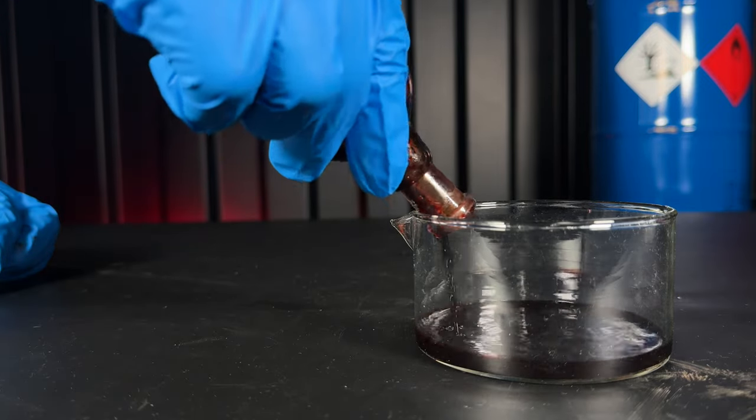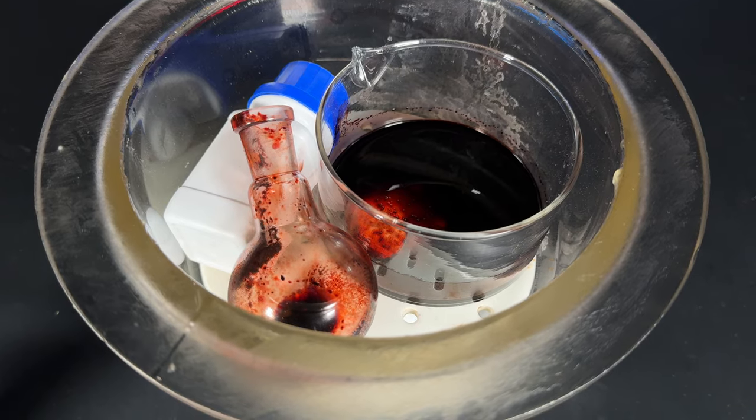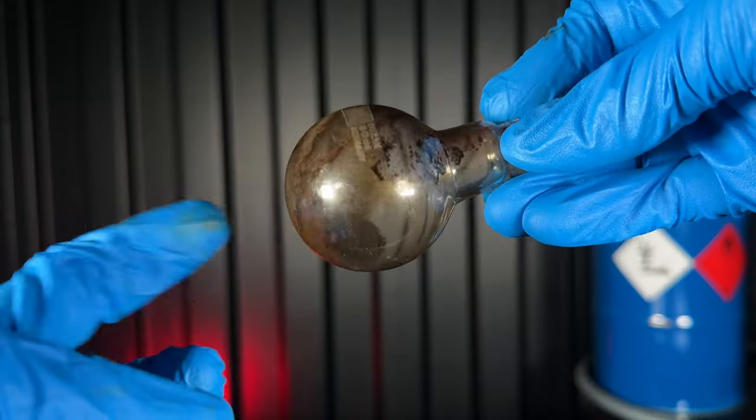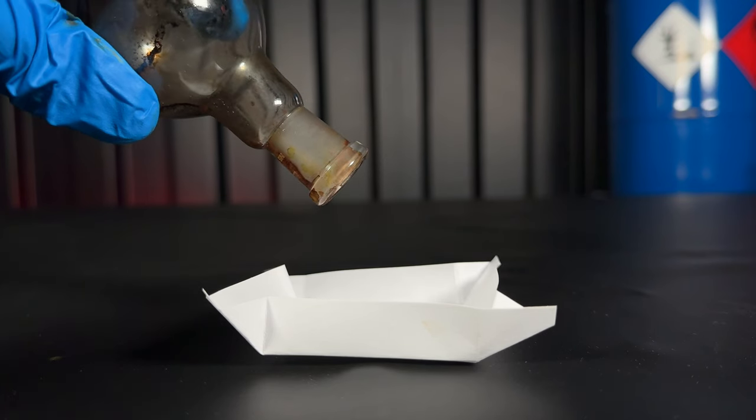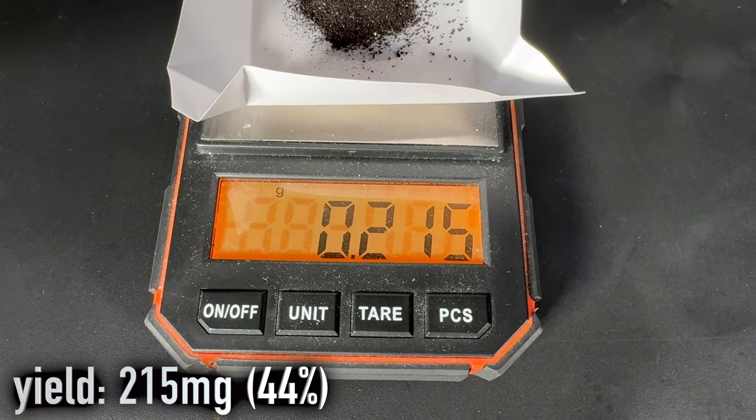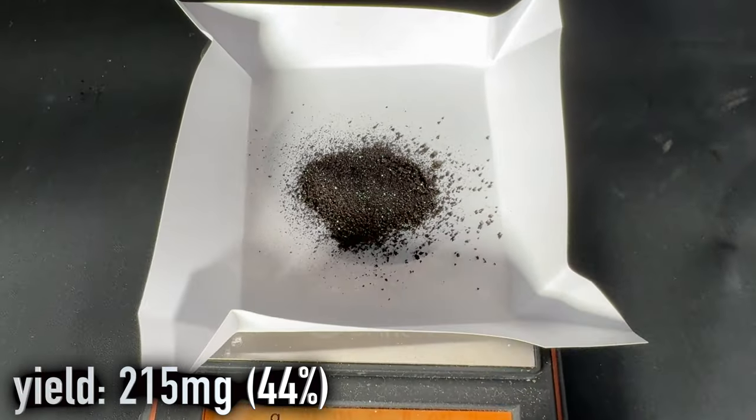I decanted off the remaining blood and put the flask into a desiccator. I evacuated it, let it stand overnight and the next day I was left with this black powder. In the end I got 215mg, which is a 44% yield.